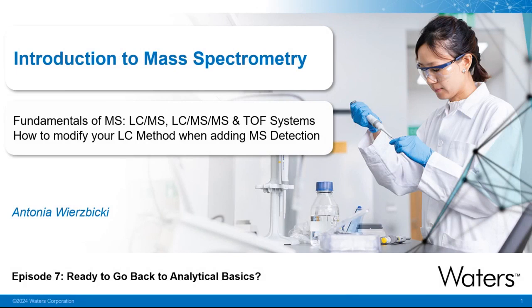So we'll cover the fundamentals of mass spectrometry, starting with single quad LC-MS, and then tandem quadrupole LC-MS, and then time-of-flight systems as well. And then we will talk a little bit about how to modify your LC method when adding MS detection.